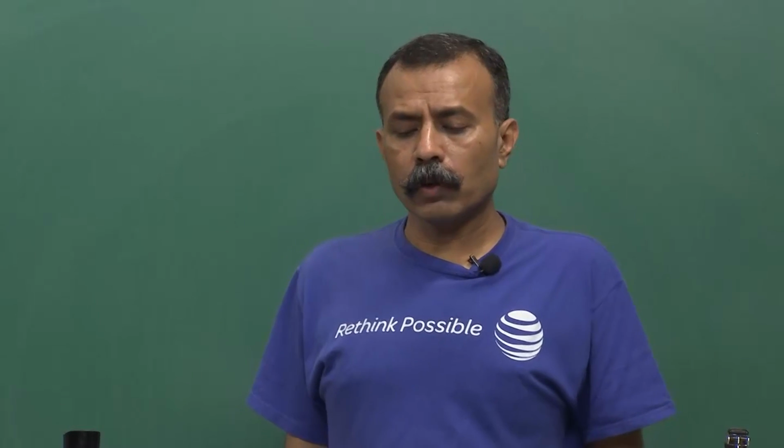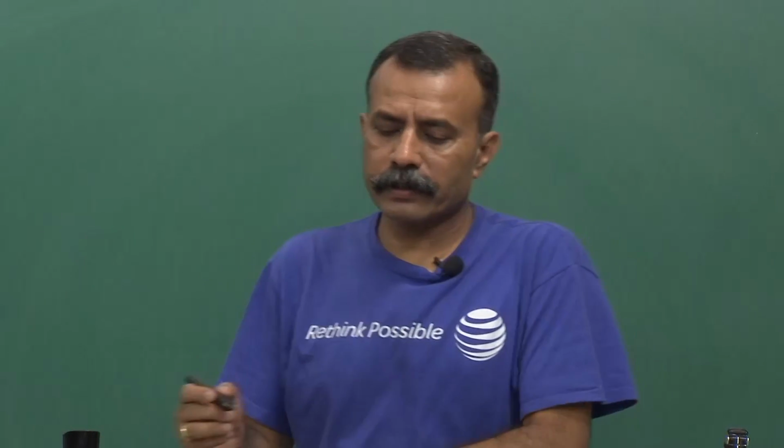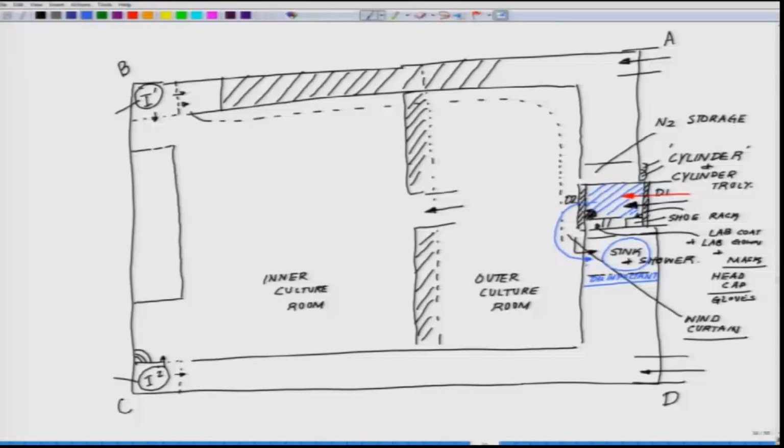Okay. So, the best idea is that, say for example, all these rats and mice come in different kinds of cages and everything. So, first of all, they arrive from the animal house. So, you have to have a designated animal house, and having said this, let me mention here, you need it for any kind of animal studies, you need ethical clearance.